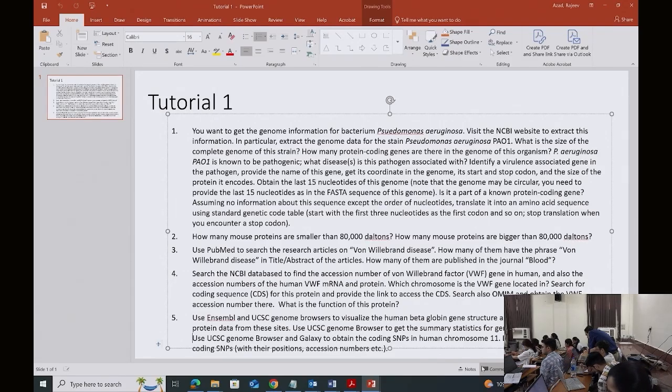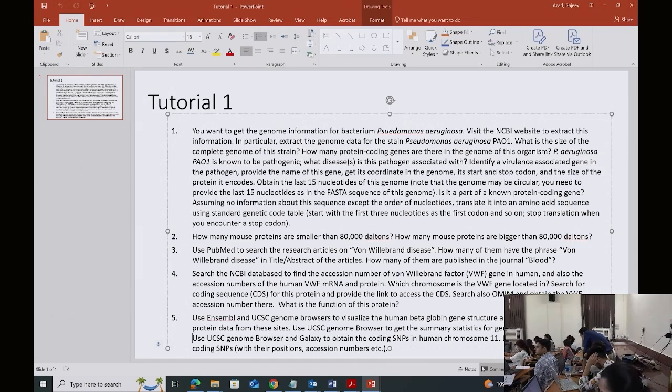Okay, I will go to table browser. Table browser, and then I don't know what is all this actually. No, I think there is some problem. Genome is played. Let's go back. Genome browser.